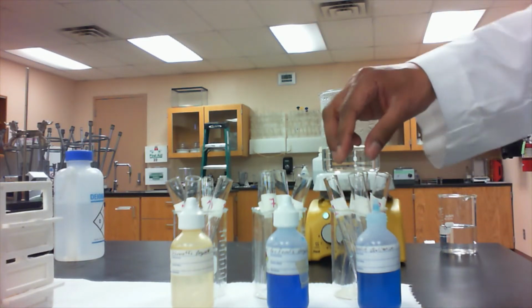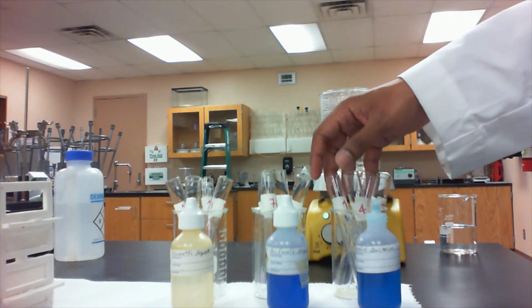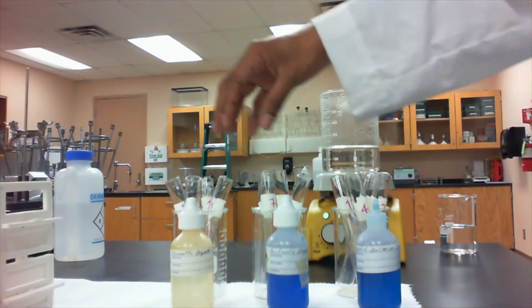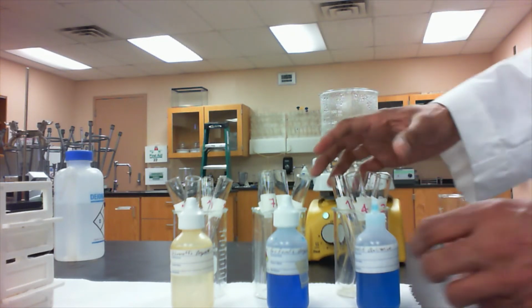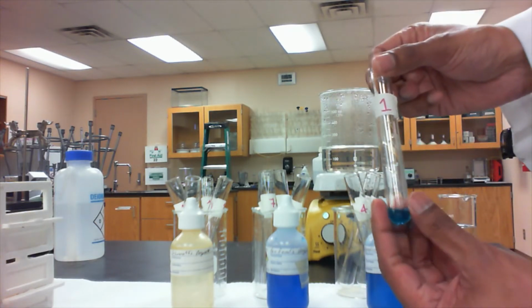So I have my test tubes here labeled 1 through 12, just like your instructions say. I've separated them into groups of 4. We have 3 groups of 4 that correspond to the 3 different tests that we're going to be doing. In each of the corresponding test tubes, I'm going to add 20 drops of each of the reagents.